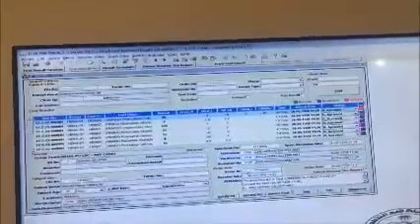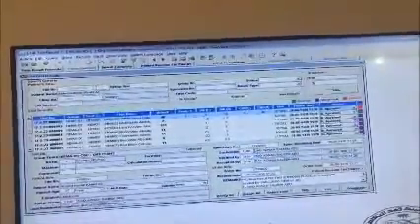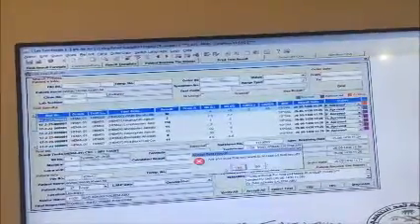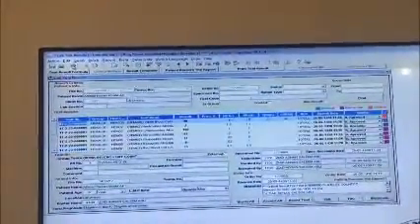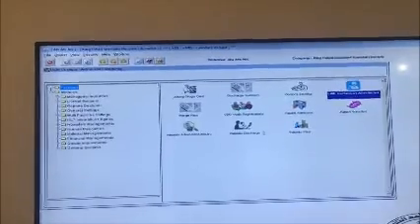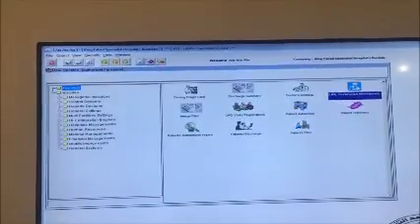It becomes a panic value, don't worry. Again, save, verify, and accept. Okay, that's it regarding the lab test.